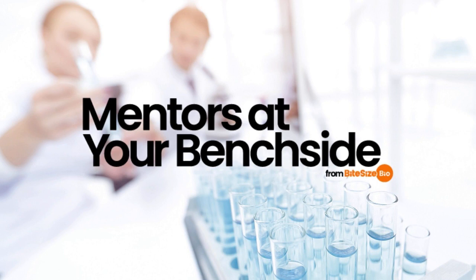Let's assume that your scale is accurate. You still must consider the precision of the measurements. What if the scale is on a wobbly table, or a vent that turns on and off affects the measurement? In this case, the finished culture might turn out slightly different from week to week.